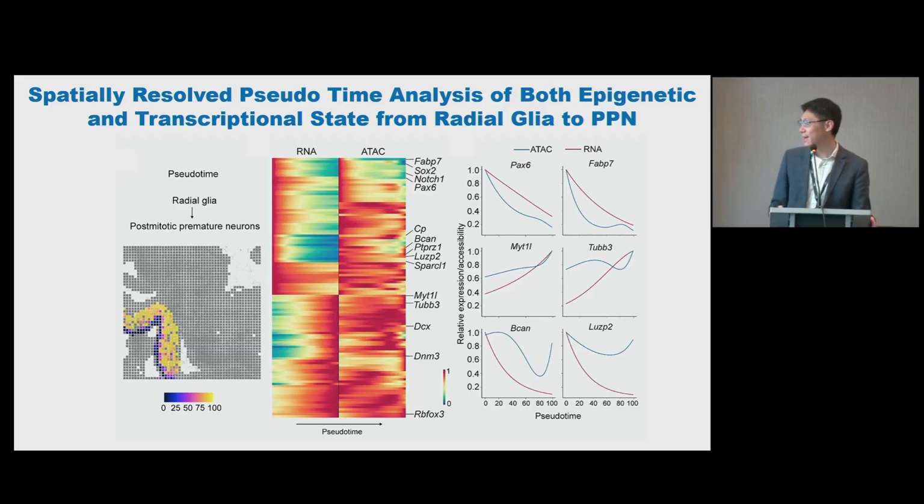They're not for neurons. The implication here is that even though those cells already decided they're going to become neuronal lineage cells, they somehow still retain their chromatin state for other lineages, in particular oligodendrocyte lineages. During the developmental stage, we didn't see that they were able to transdifferentiate into oligodendrocytes, but when something goes wrong, he found that in neuroinflammation some of those premature neurons might transdifferentiate into oligodendrocytes. Some of those oligodendrocytes have a very distinct phenotype. They're called immune oligodendrocytes, which behave like inflammatory cells and play a role in the pathogenesis. I think that makes the story all of a sudden very clear and very complete.